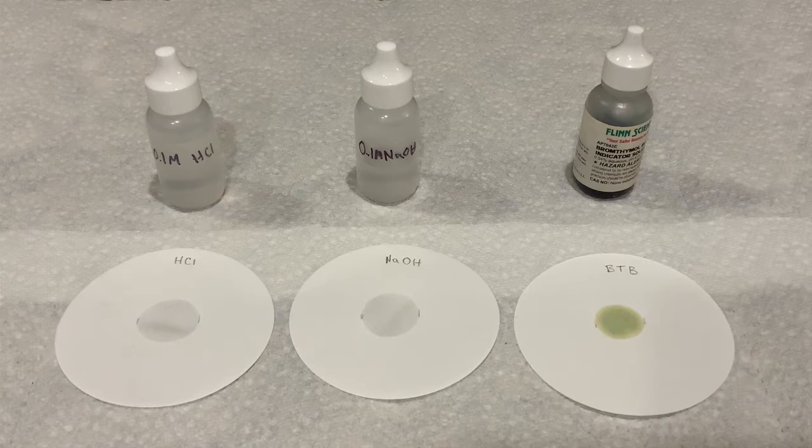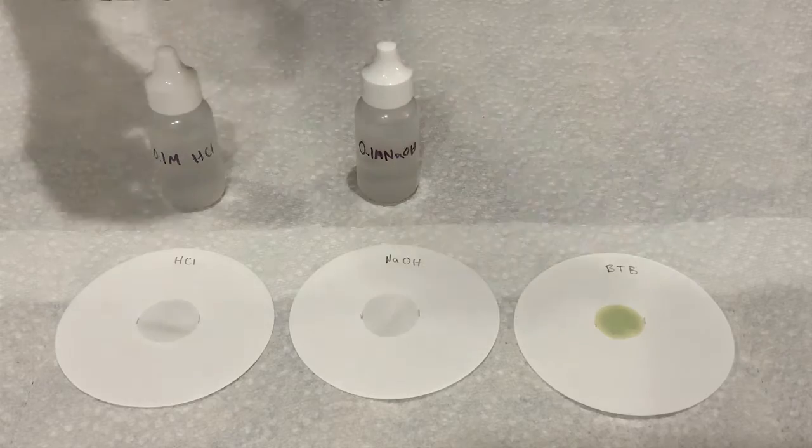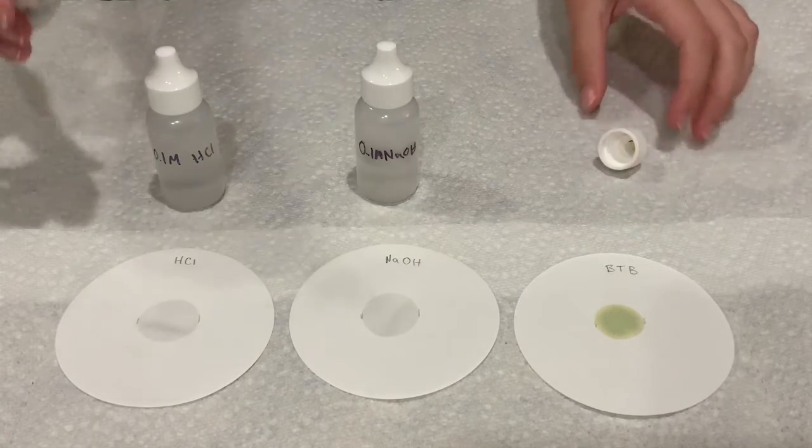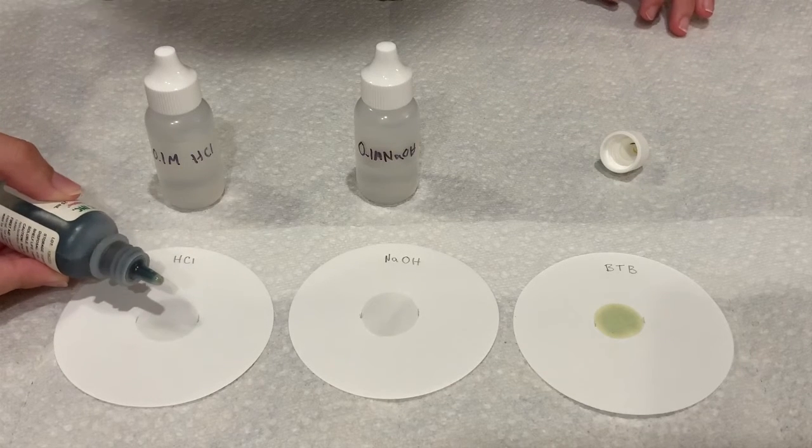All right, so the next part of the experiment will be to see the impact of the indicator, bromothymol-blue, on the acid and on the base. So we're going to put a drop of bromothymol-blue in the middle of the acid drop and in the middle of the base drop.